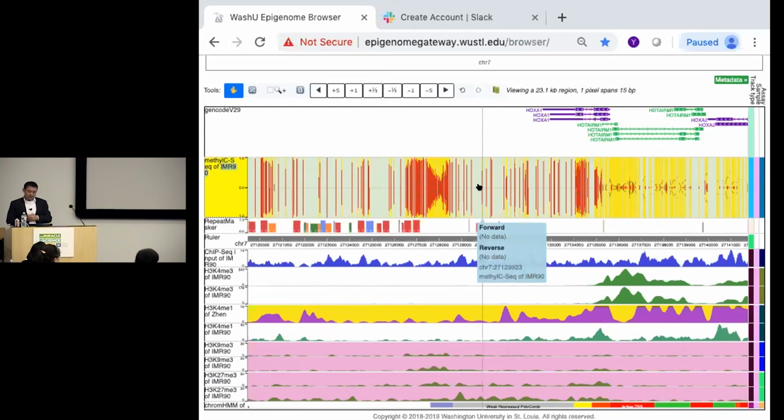This is a way to just illustrate that we have thought a whole lot about how to present genomic data. It's the same data, it has all this information, but how do you let that information come out visually?